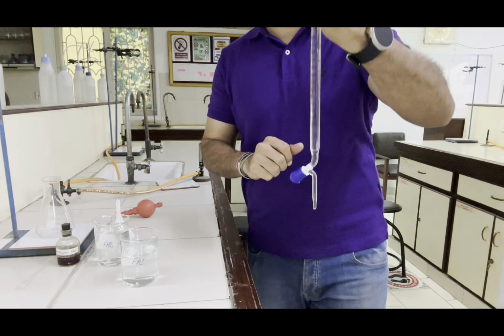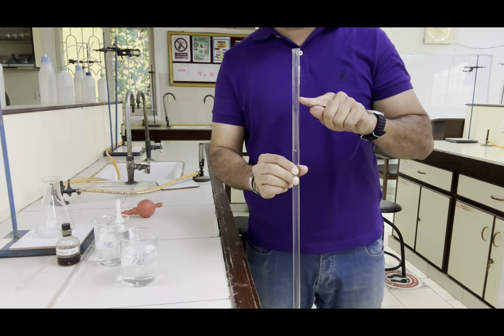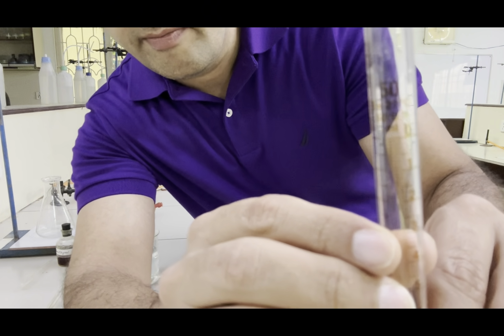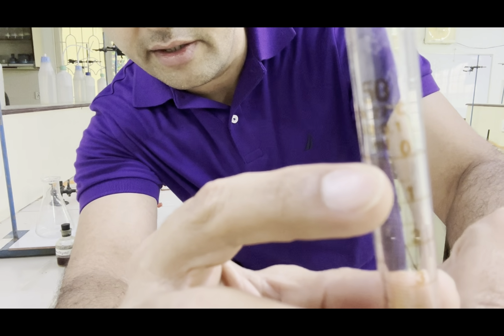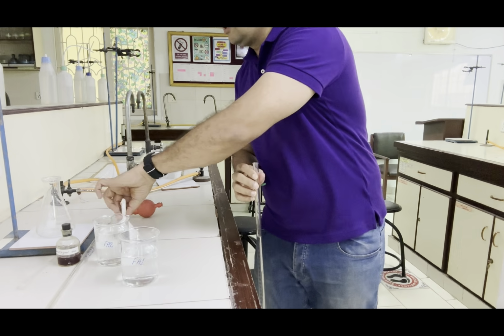Now we will make the level of this FA1 to this 0 mark. So here you can see the 0 mark is here. We need to fill the liquid up till here, up till this mark. So let me fill again.